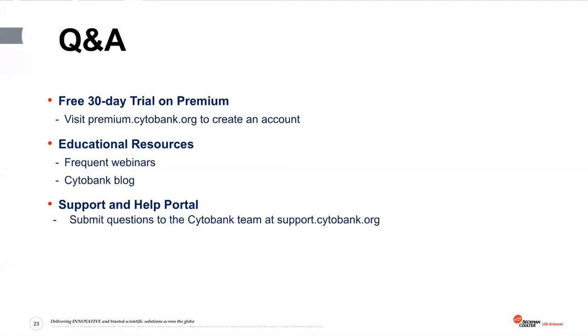Will a premium license of Cytobank support this analysis? For example, starting from the FASTQ, needing a storage commitment, or what will be the working with it after the Cell Ranger processing? I hope so. Jihao, do you understand the question, or do I need to decode it a little further? I can see the question, and I believe I get it.